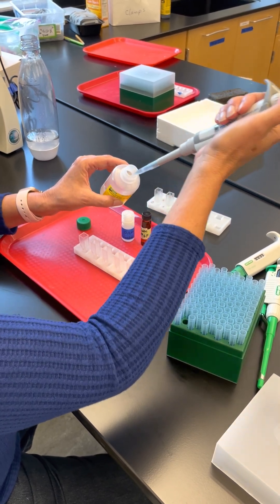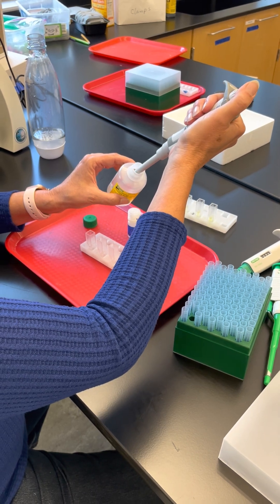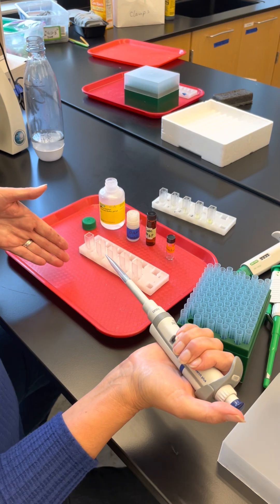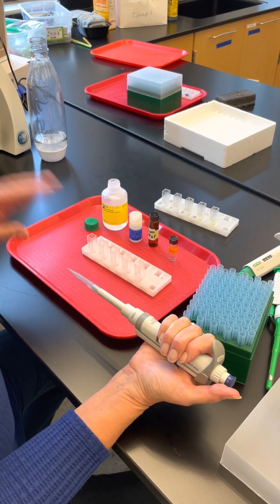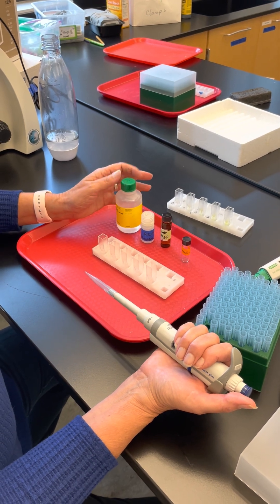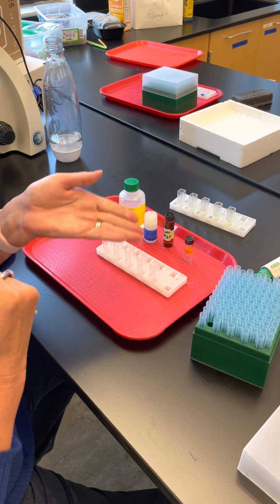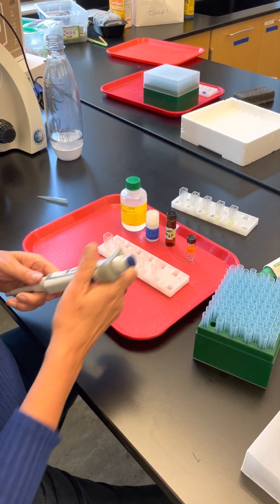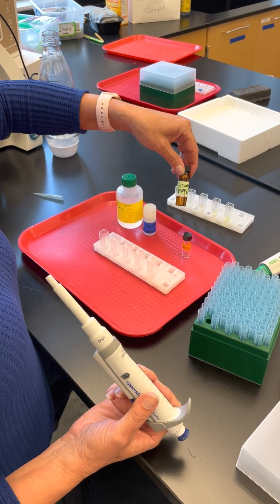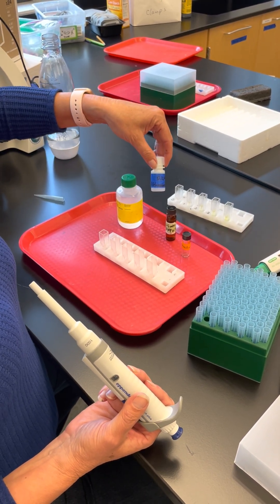The stop solution is a buffer at a very high pH. When you put the reaction into it, it will denature the enzyme and stop it — that's why it's called stop solution. Always change tips when switching between solutions. We're going to use two milliliters of the substrate and one milliliter of the enzyme.